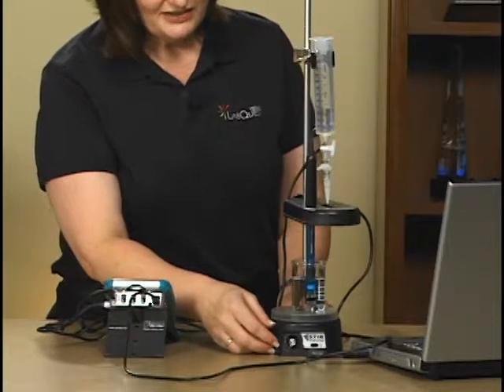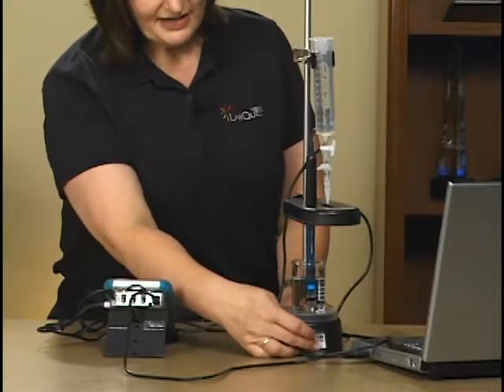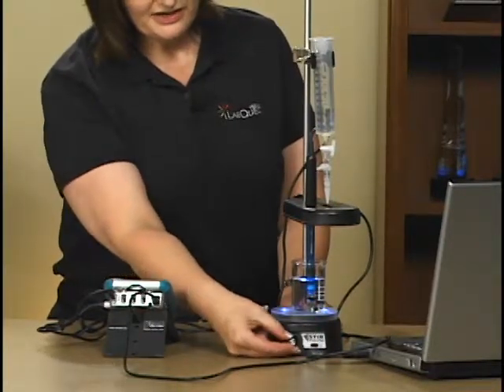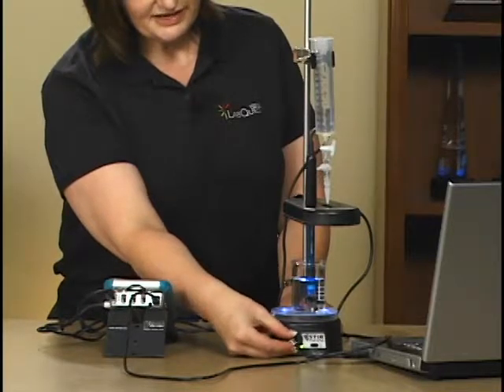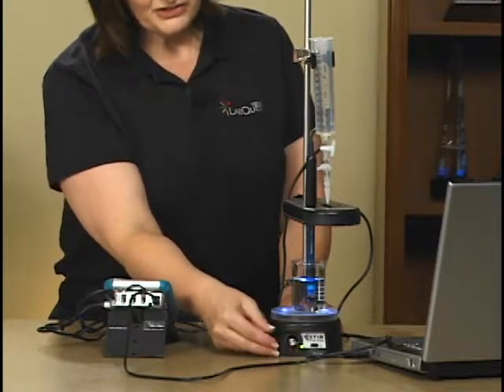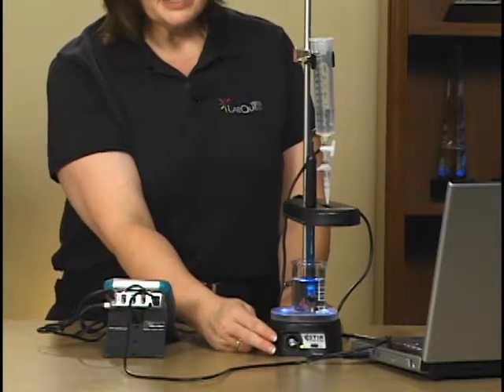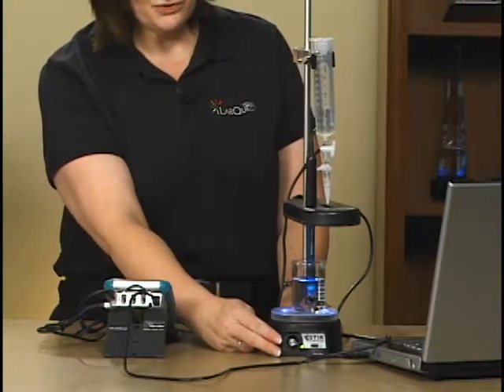We'll start with a stir station. This is our magnetic stirrer, and it has some LEDs I'll turn on here and then turn on the stirrer itself. This stir station has a built-in ring stand. It can also be run on batteries or through AC power.